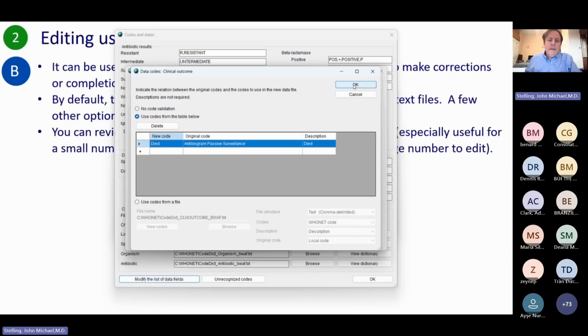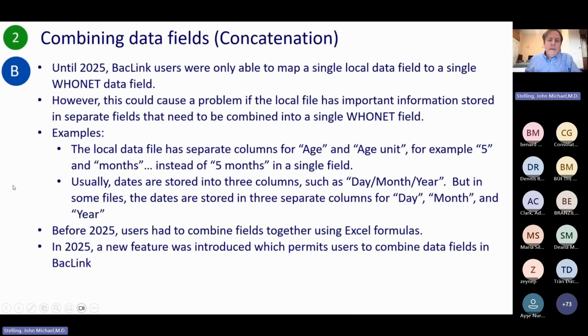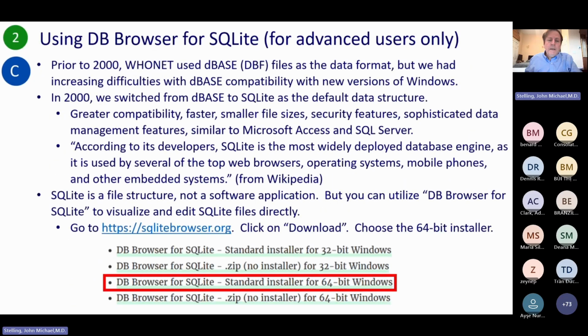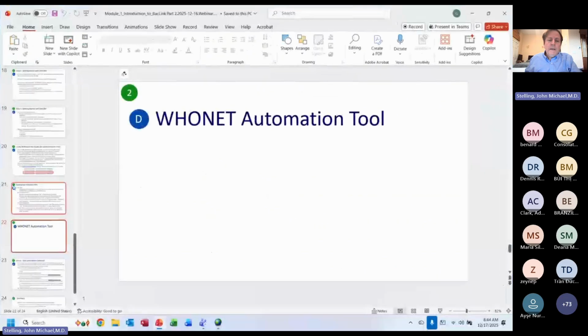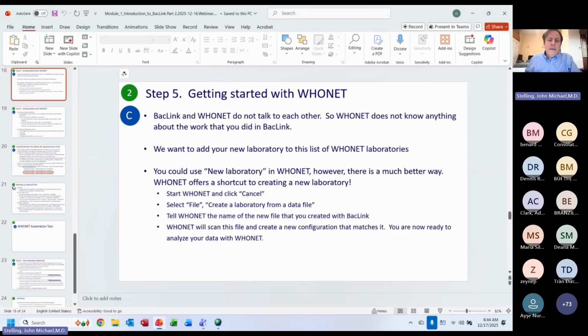You say OK here. Getting back to my PowerPoint. So that's reviewing and editing dictionaries. Combining, concatenating. I'm just looking ahead, getting started with WHONET, DB browser. And that's the end of it, I think. No, OK, good. I'm just looking at the time. Still have 15 minutes. OK, concatenation.